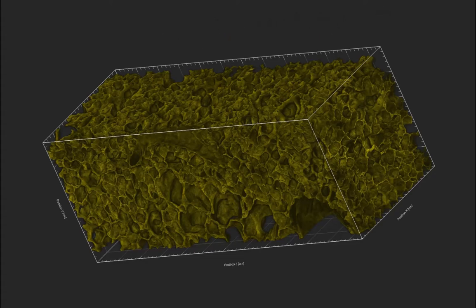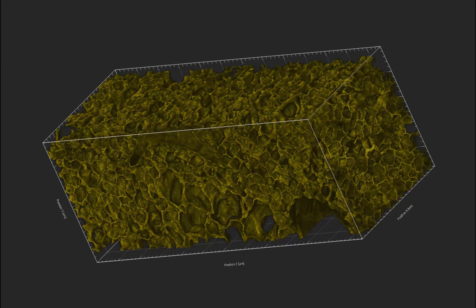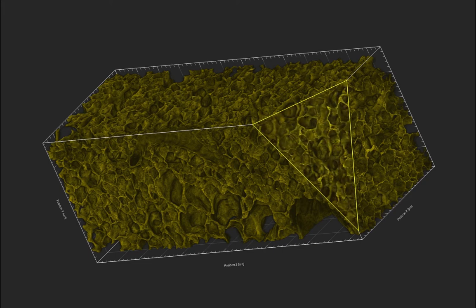So the tissue is specially fixed and prepared so that it is hydrated, and that's very important because you can see how the parts of the lung here, you can see the interstitial tissue has thickness. And so now we're going to run the video and just show you what that looks like. A plane of slice here, and I'm going to stop the movie at points of interest.